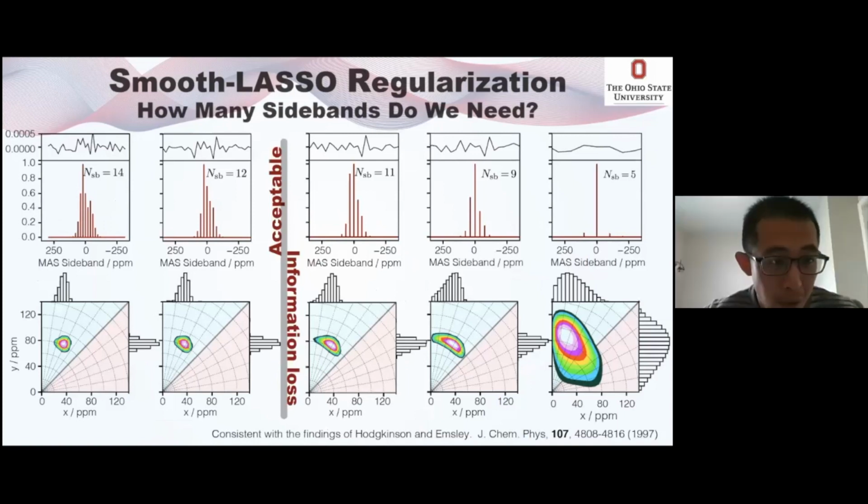All right, the last remaining question is from Zhuoren Wang. Impressive talk, thanks. There is one point I didn't quite get. When you build your set of sub-spectra, you discarded identical spectra with different CSA parameters. Then to me, it seems that the distribution you find may have some ambiguity. Can you explain that part again?